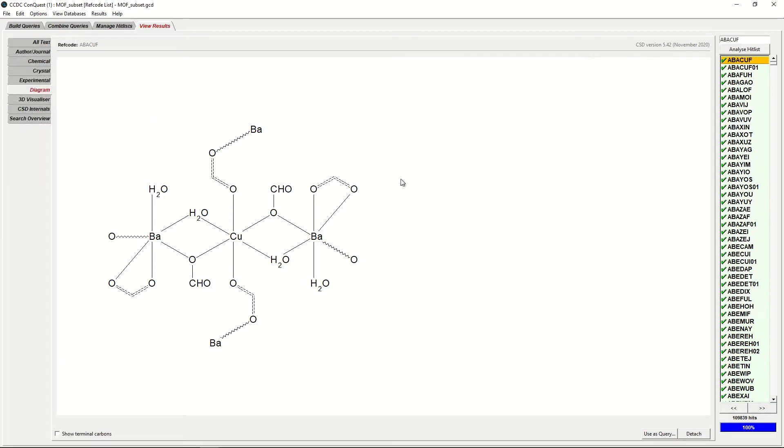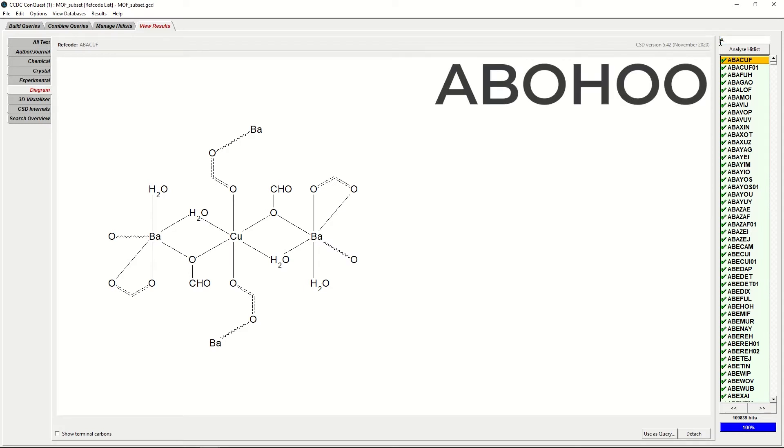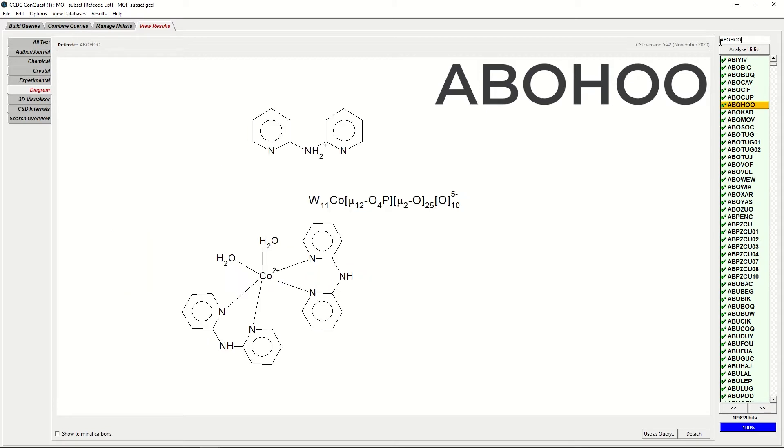However, our structure of interest today is ABOHOO. In order to look for this, you can either scroll down the list on the right, or you can type in the window above ABOHOO.